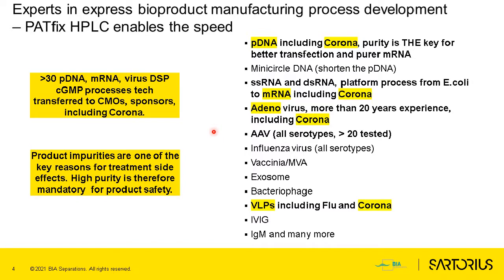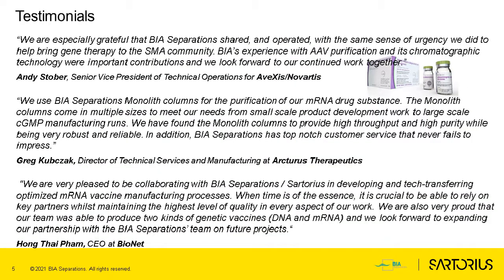Lately, a lot of work with exosomes, phages, bacteriophages, so viruses which kill bacteria, and also other virus-like particles. This is more or less our main target. We also have some experience with proteins, especially from human plasma, but mostly we deal with viral particles, plasmids, and mRNA.